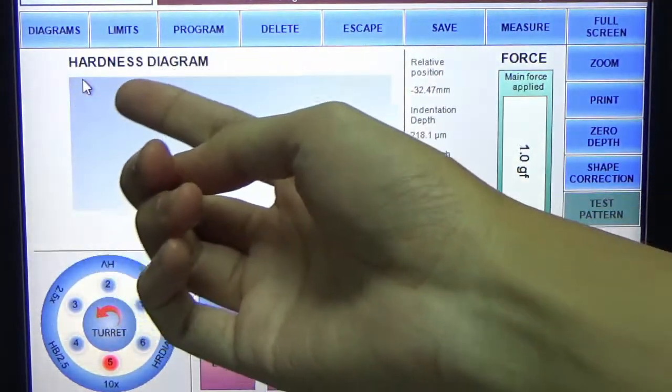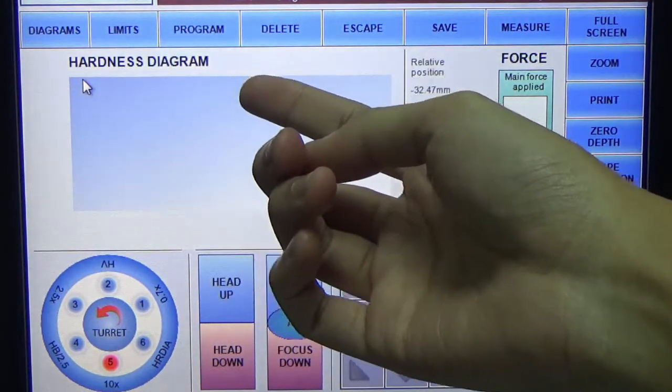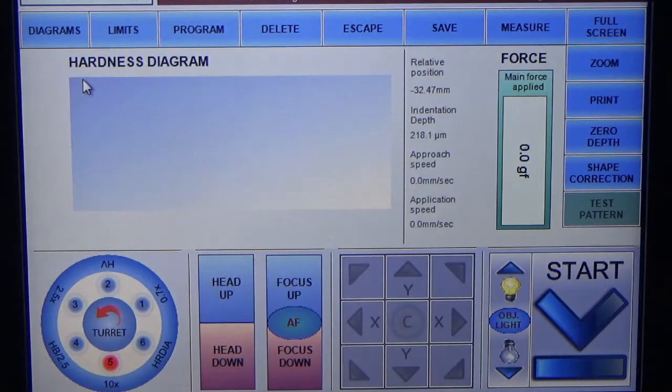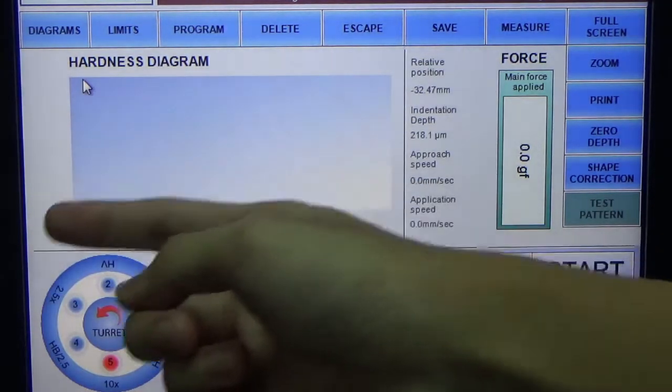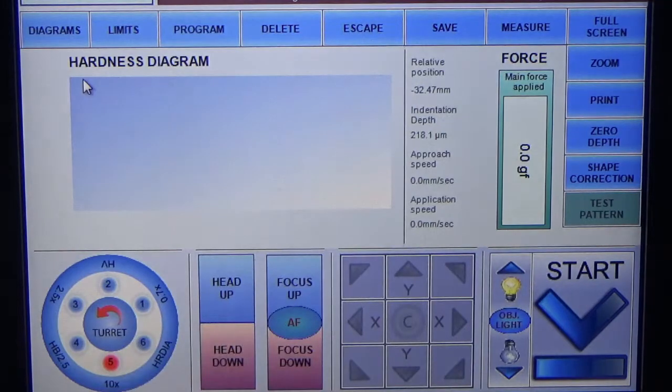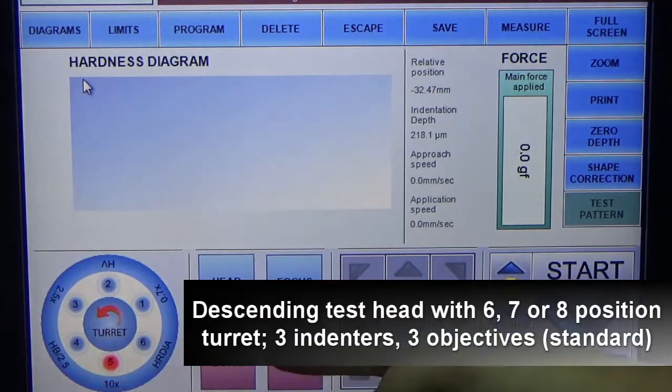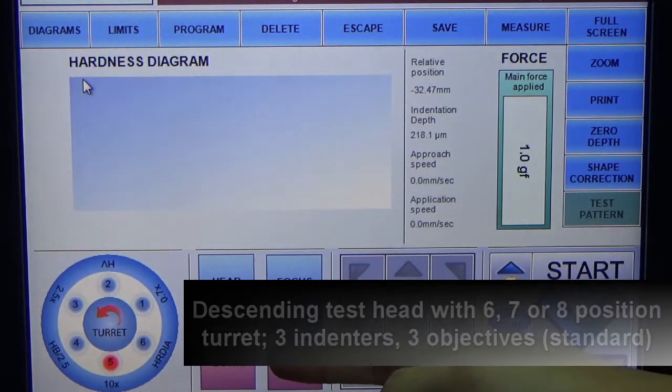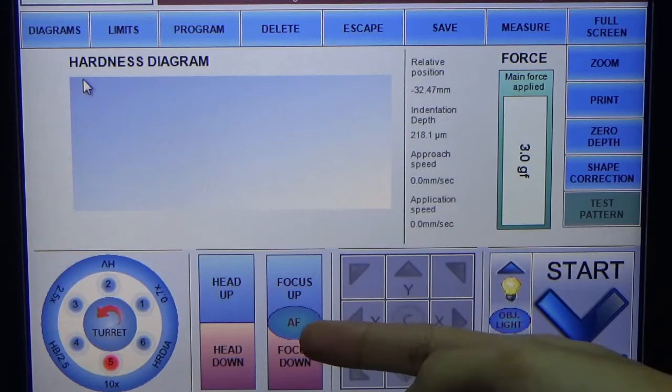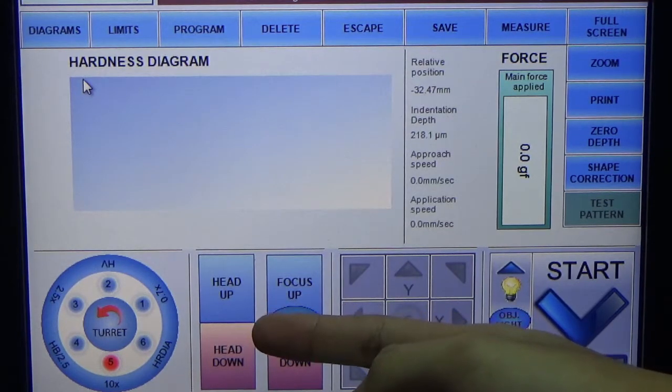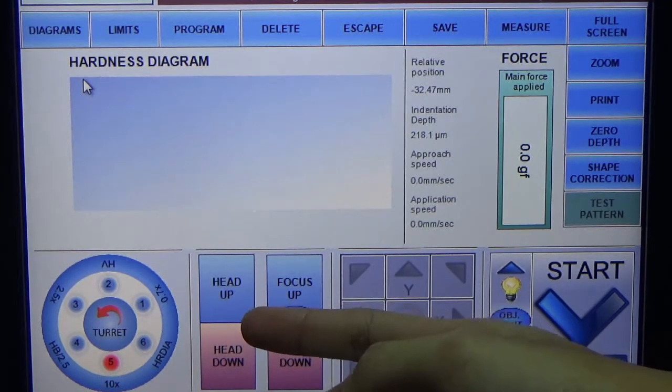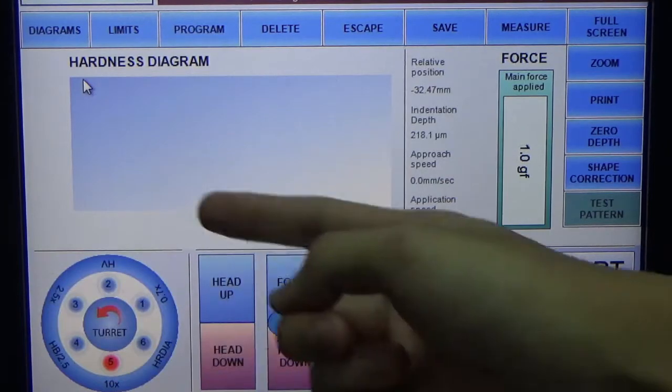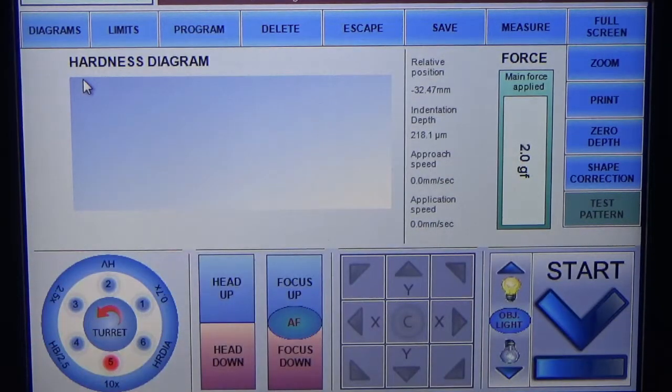There are diagrams, limits, programs, as well as other functions. You can see here the configuration for the turret, so you can actually put three objective lenses and three indenters, and you can configure these indenters and objective lenses as per your usage.